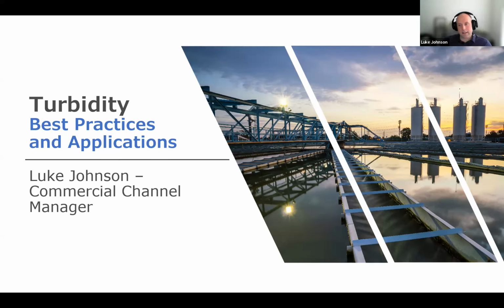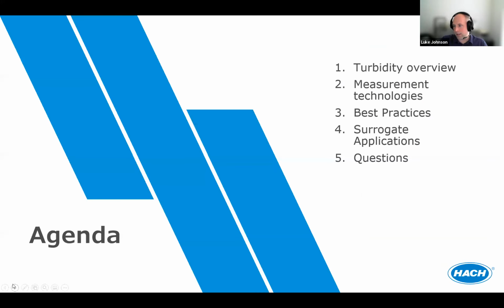So like Diane said, today we're going to be talking about turbidity, about some best practices and some applications. Let me jump to the next slide here and we'll look at the agenda. We'll start with an overview of turbidity and then move into the various measurement technologies for turbidity. We'll talk about some best practices and some surrogate applications.